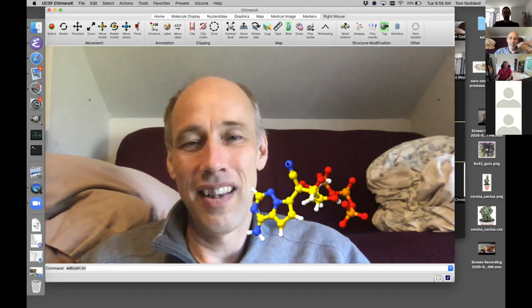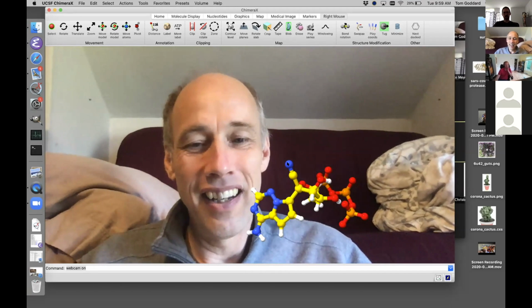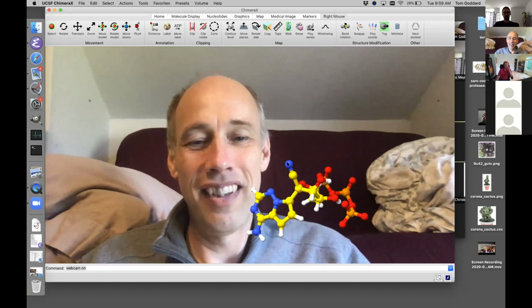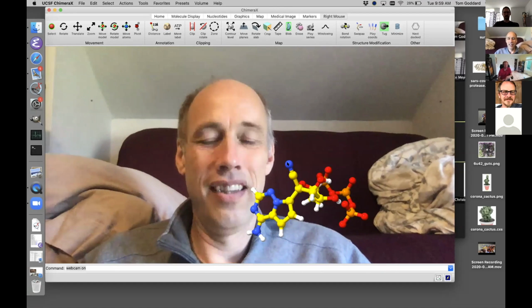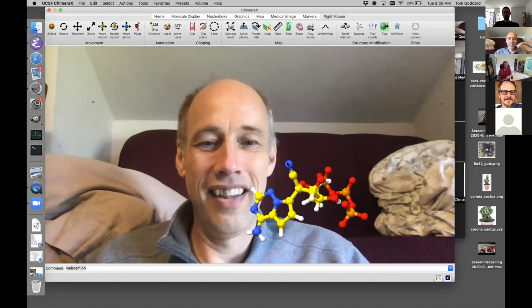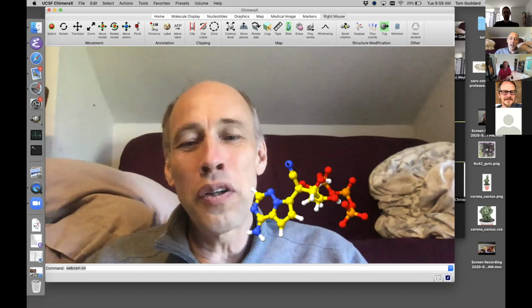So to some degree, it's a chicken and egg sort of thing, right? And once the devices are powerful and do great things, more people will get them. Just to speak to that, we still have people at our institution who are using dial boxes. We sort of hacked them onto Linux systems so they sort of work, right? Yeah. But people like their dials. They'll go to extreme lengths to make them work. And the dials are great.